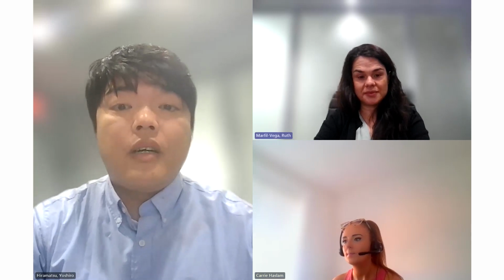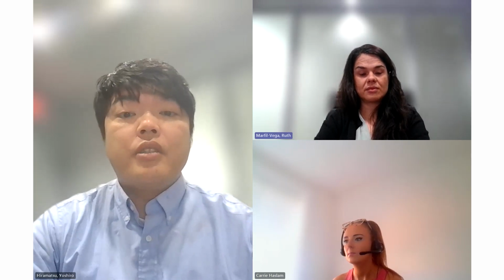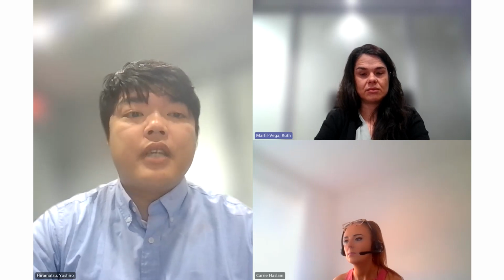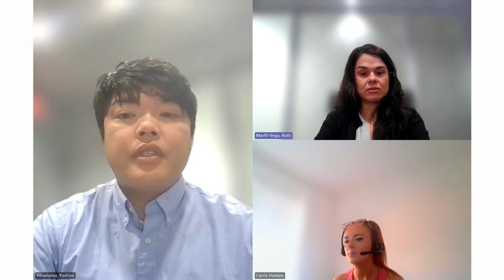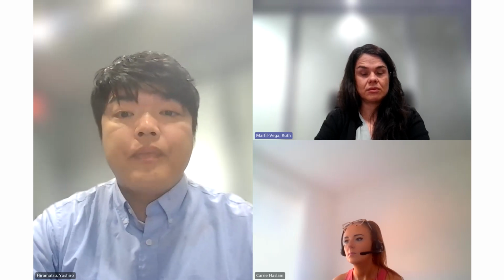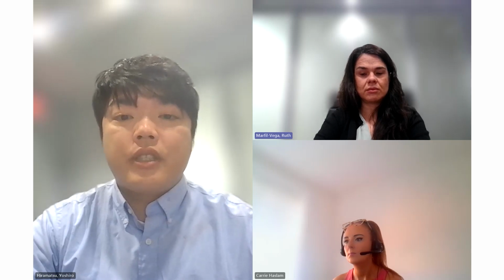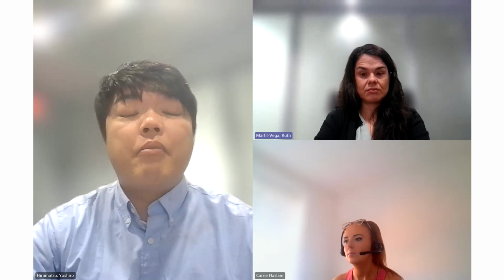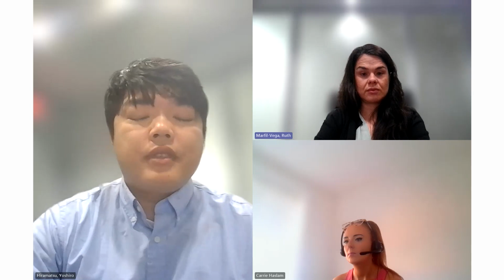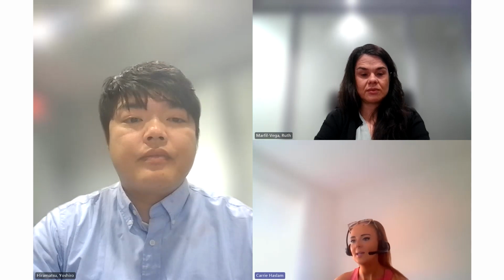I will take one. Shimadzu has a nice function in method management for updating retention time. We call it AART, Automated Adjusted Retention Time. Once we inject an N-alkanes mixture after new column installation or trimming the column, we can update all the retention indices at once using the N-alkanes result. So you don't need to update the retention time one by one using several standards. That's great, thank you.